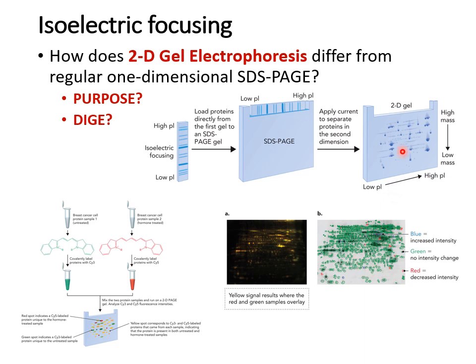This is because this one will first separate the proteins on the basis of what's called the isoelectric point, from low to high. PI means the isoelectric point. And then it will further separate on the basis of size, just the way the one-dimensional gel did as well.